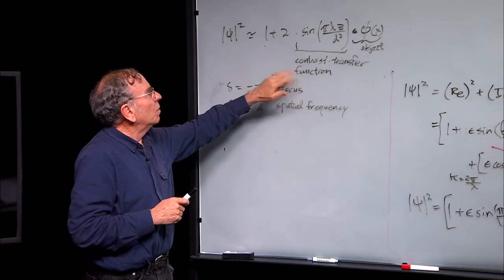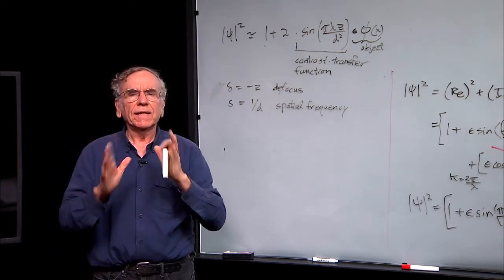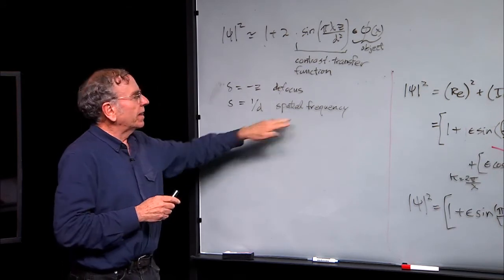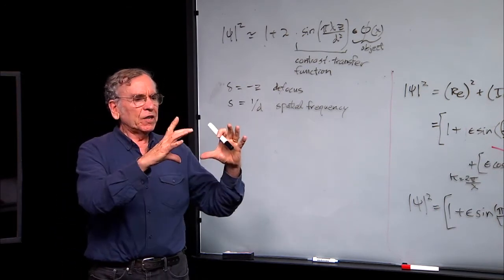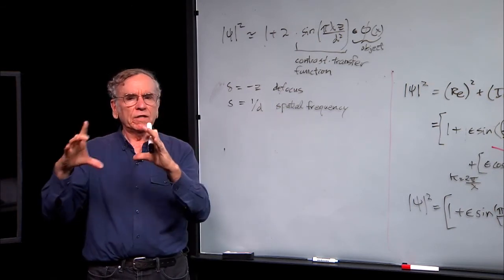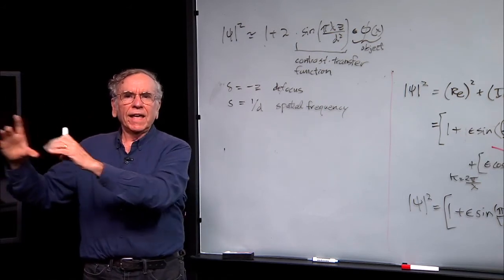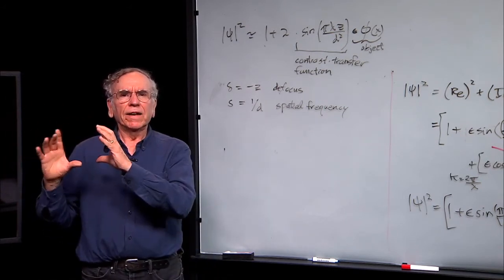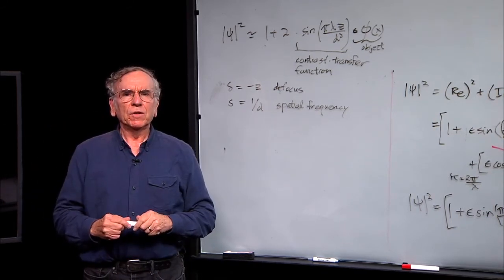And we know, once we have a grating, what the contrast transfer function is going to be at that periodicity or at that spatial frequency. And that means then that we can take our object, its density, decompose it into gratings, ask what happens to each grating, and put that back together, and we will have then a model of our image.